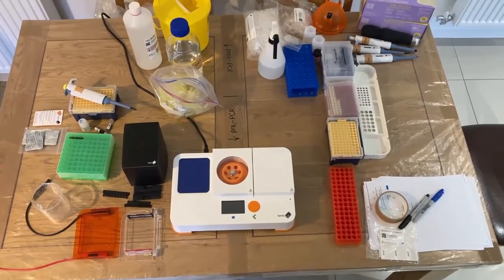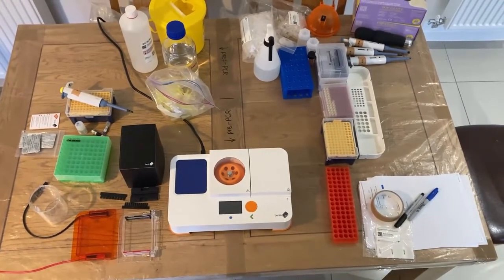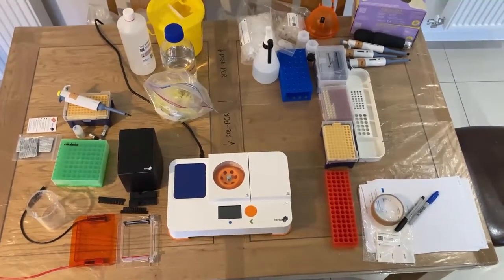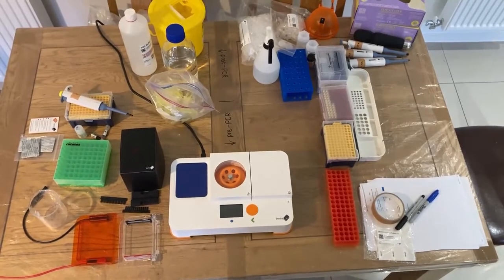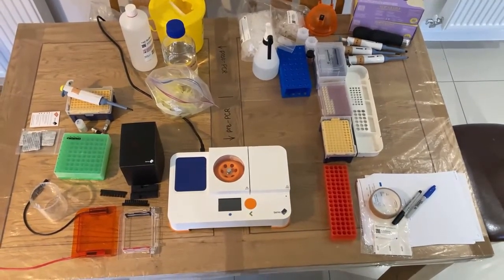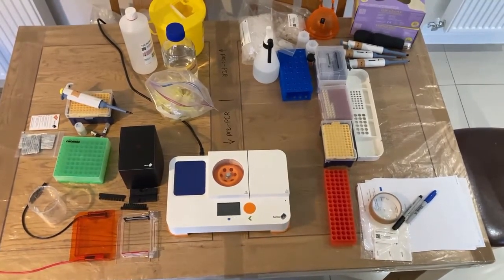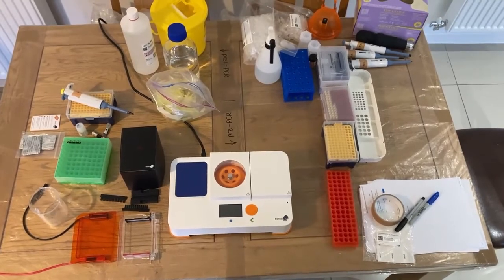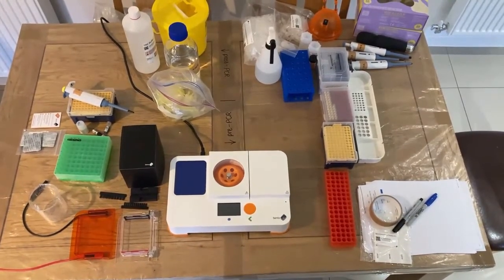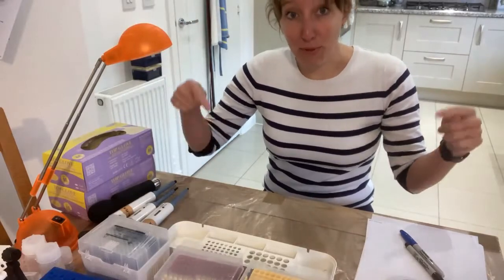It's not strictly necessary to do this, but it's very good molecular biology practice to keep your pre and post-PCR products separate, just to reduce contamination. Because I'm working with things that might end up being in the kits that are sent to you, I need to make sure that they cannot be contaminated. So when you see me on Twitter doing DNA extractions or setting up PCRs, I'm always sat at this end of the table — my pre-PCR end.